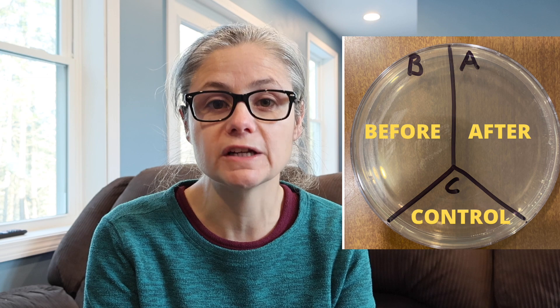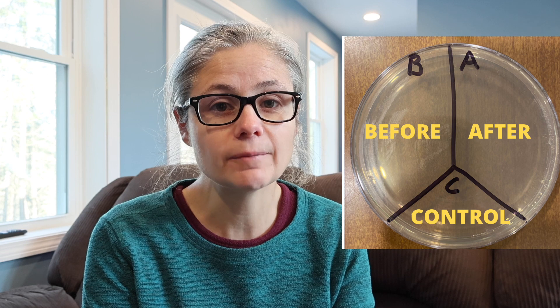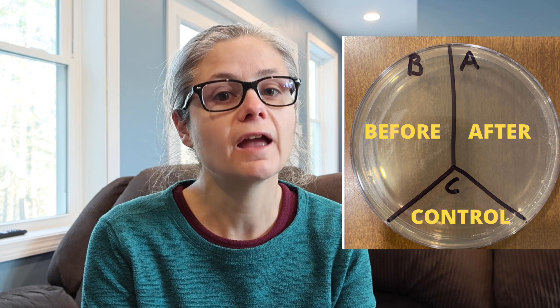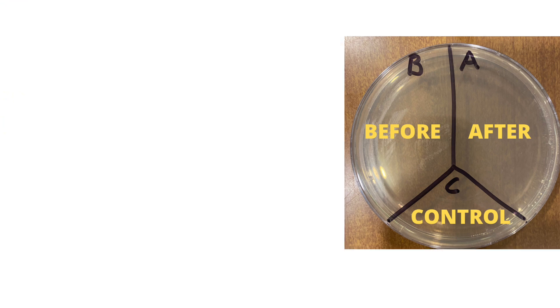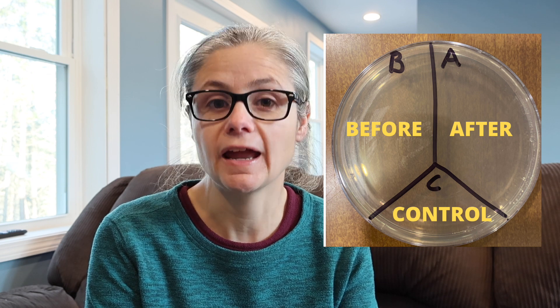Then I'm going to use a Clorox bleach spray — two cups of water, two teaspoons of bleach. This time though, I'm going to spray and wipe immediately. I'm going to spray, rinse with water, and then wipe. Swab the area again and place that sample in the section labeled A for after. The control section will have nothing applied. So let's see how well Clorox bleach removes bacteria from my home by not following the recommended six-minute sit time, but rather just spraying and wiping.